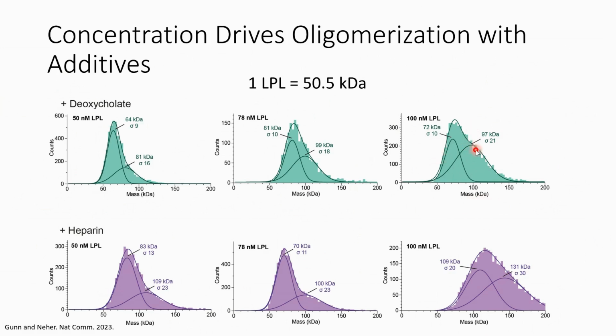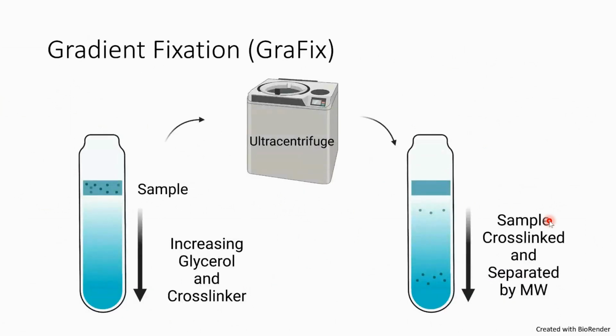You can see that this peak is still in equilibrium with the lower molecular weight peak. And that could be because of the existence of the deoxycholate in the sample, as detergent can affect how the particles impact the glass. But it certainly lets you know that the deoxycholate and heparin weren't the deciding factors as I had originally thought they could be.